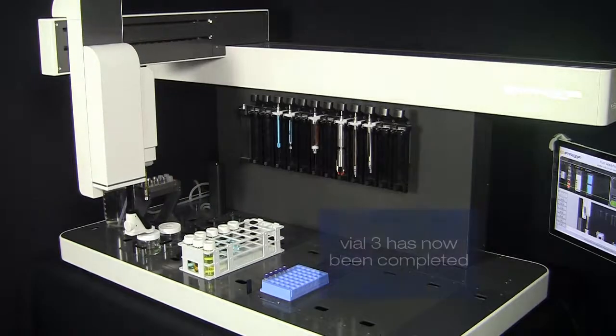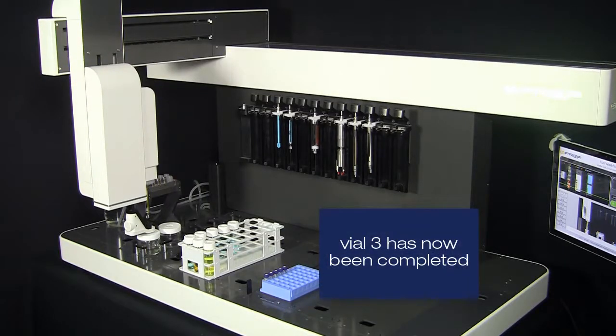So vial 3 is now finished and ready for analysis, and the ePrep continues to do its job for vials 4 and 5.